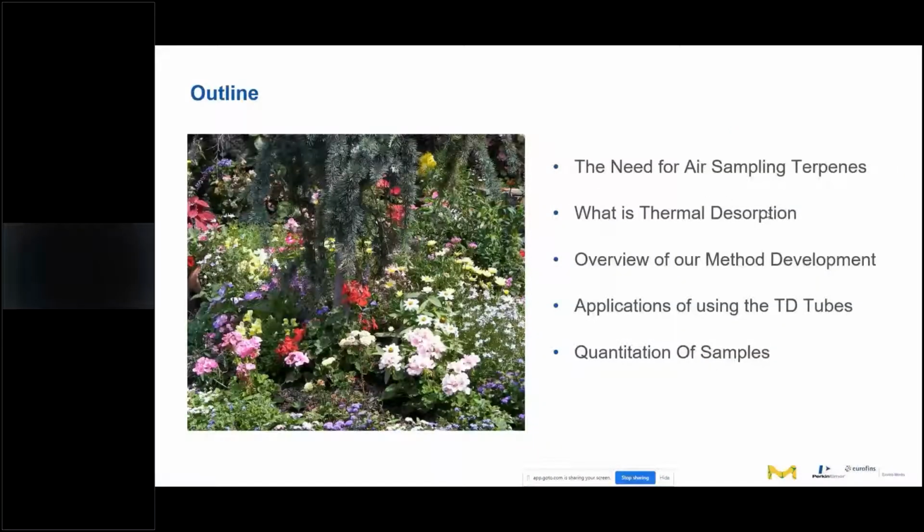We'll first discuss the need. Then we'll get into thermal desorption, which is a sample introduction technique that is used. We'll overview some of the method development. We'll discuss the applications used with the new tubes thus far, and then quantitation. How much is there?